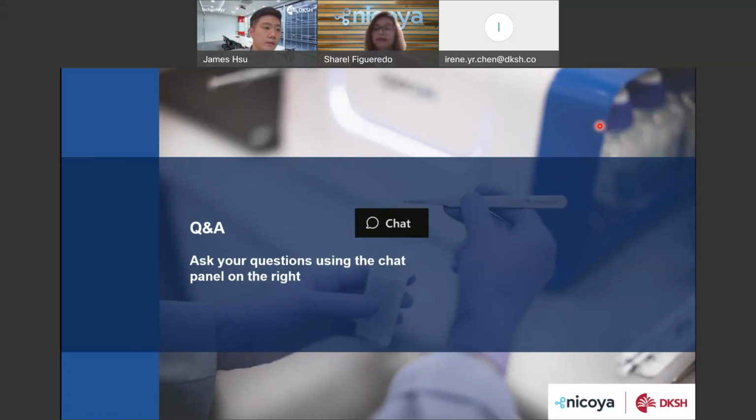Okay, and next question is, what are the advantages of the Open SPR as compared to traditional SPR? I think this is the favorite question. Yes. So, traditional SPR has a much higher sensing field because it's not gold nanoparticles, but a gold film that they use. So that sensing field is longer. What this means is that when analyte is flowing, you're most likely not measuring only the specific binding between the ligand and analyte.